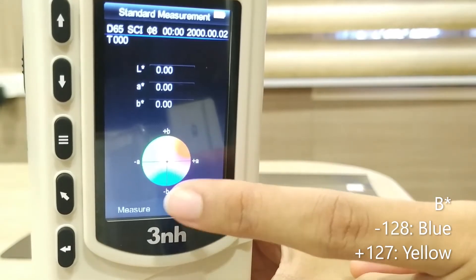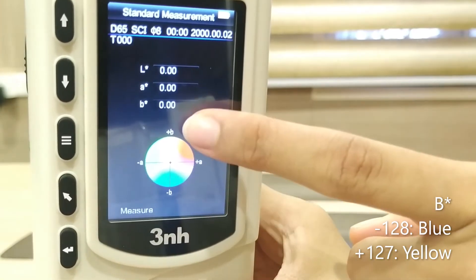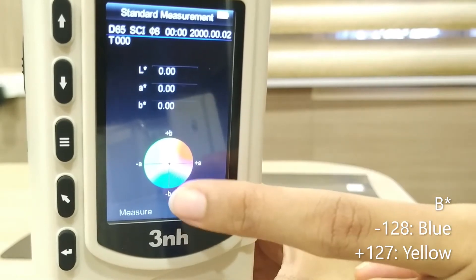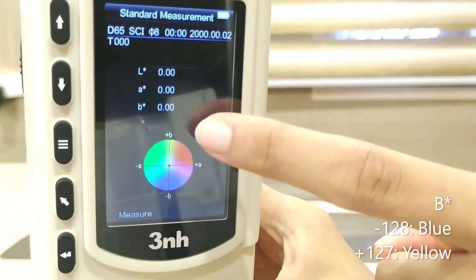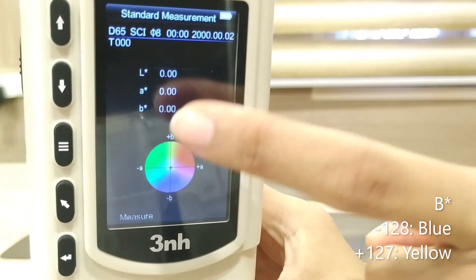The numerical range is from minus 128 to plus 128. This means that negative values indicate blue color and positive values indicate yellow color.